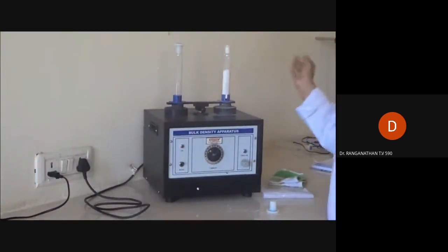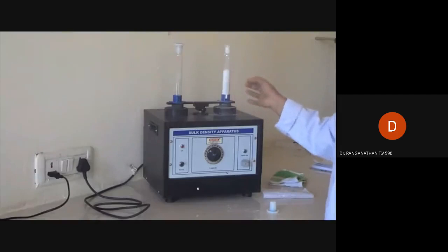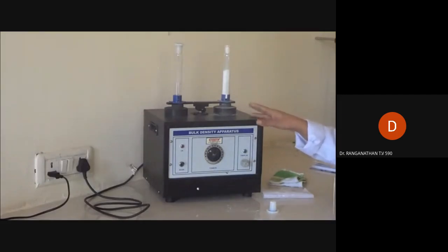Now we will record this value of bulk volume. Now we transfer this value of mass and volume into the formula of bulk density, that is mass by bulk volume. So from that we will calculate the bulk density.